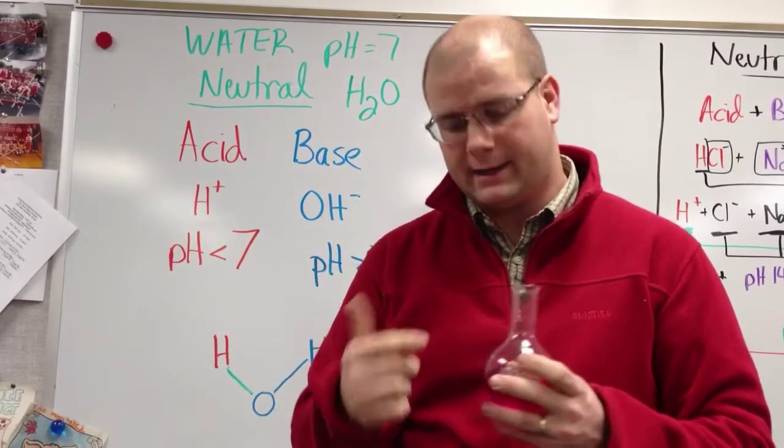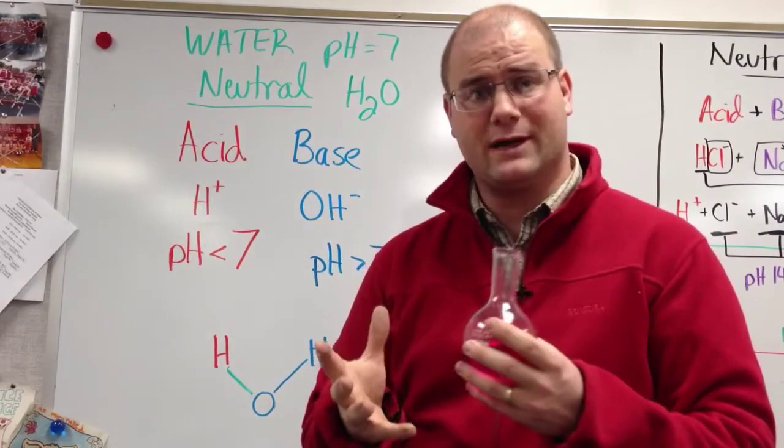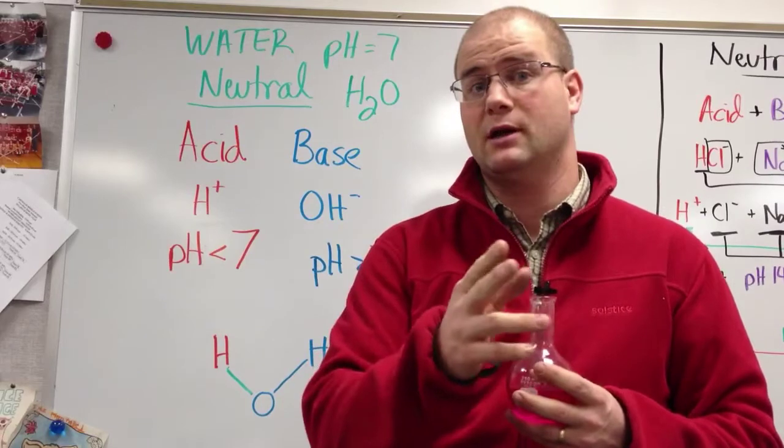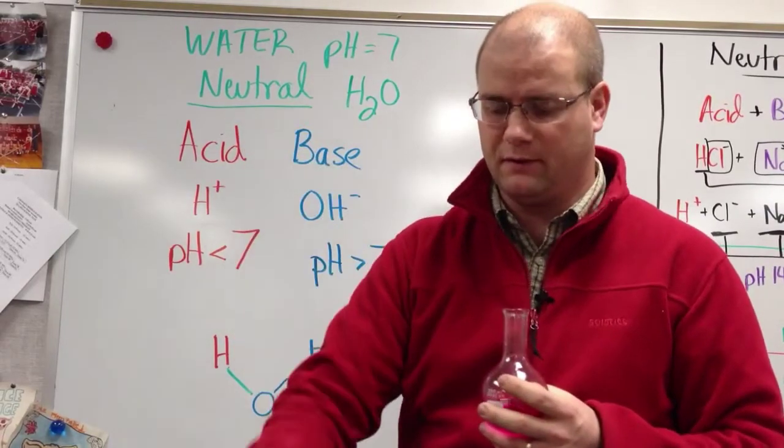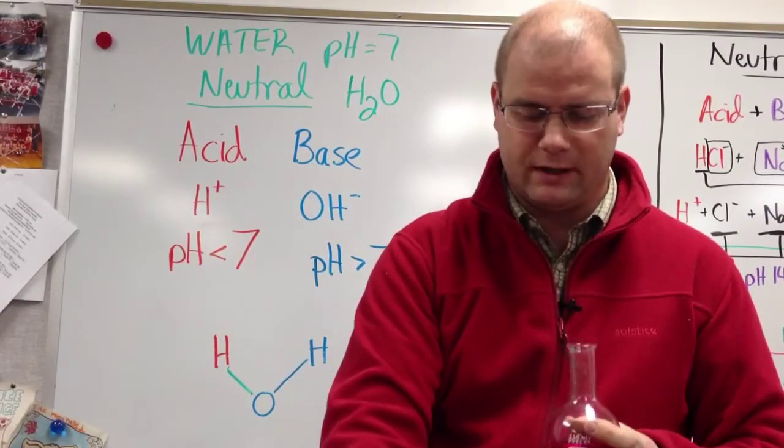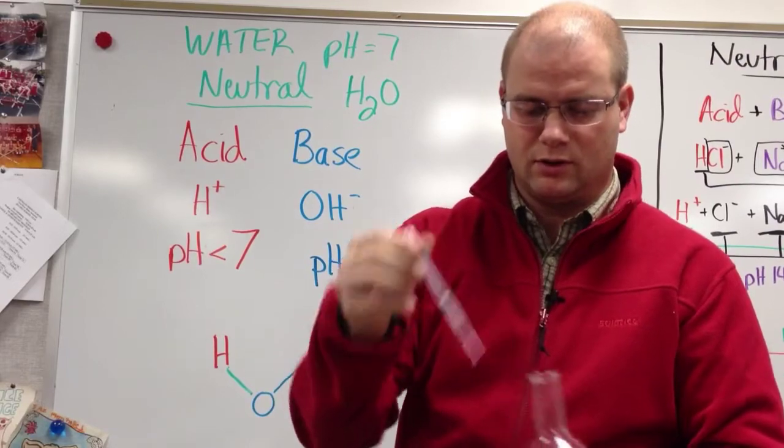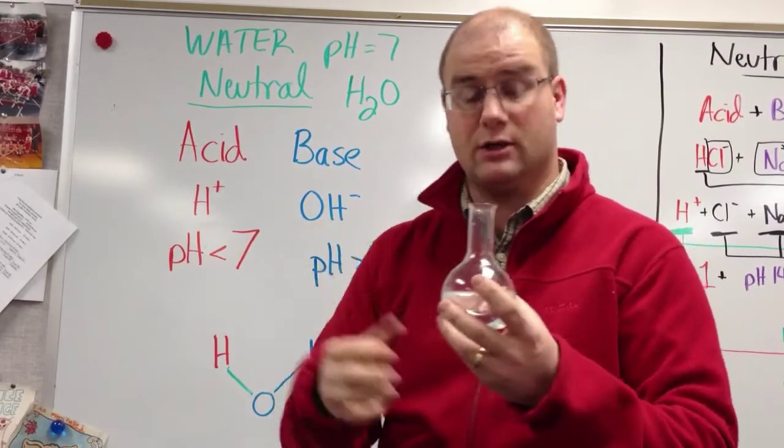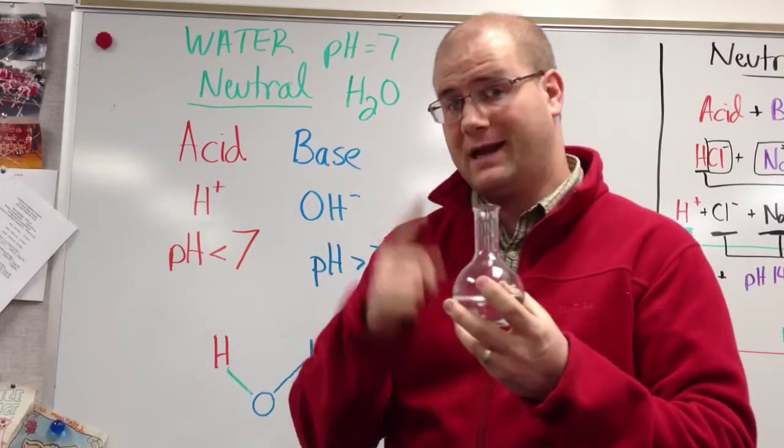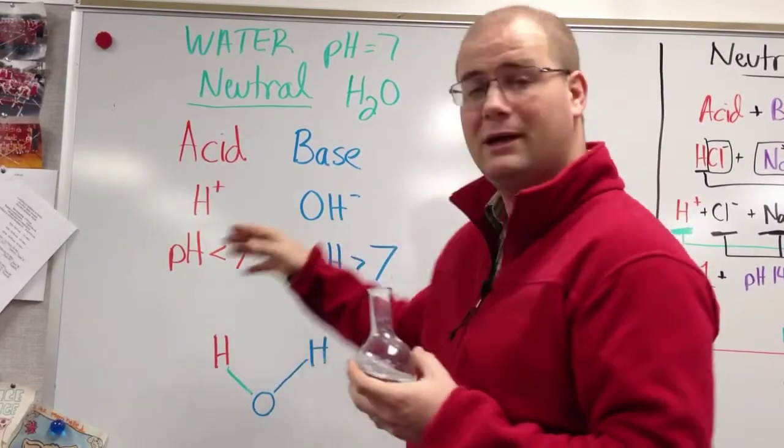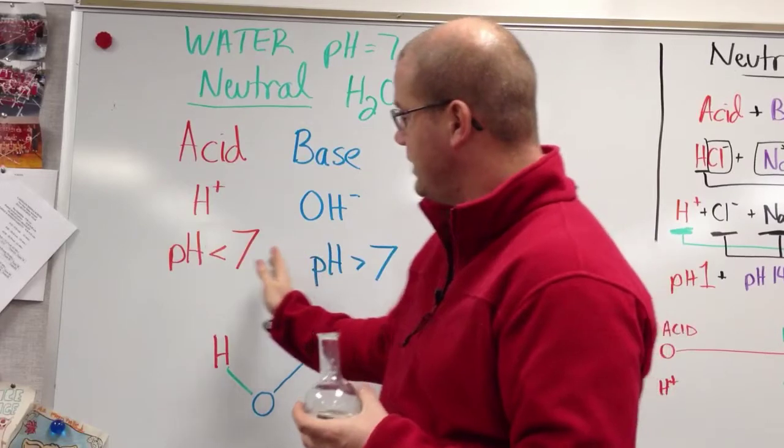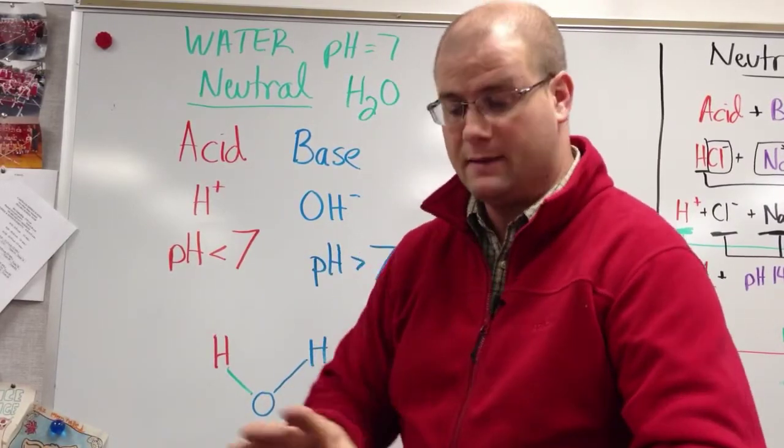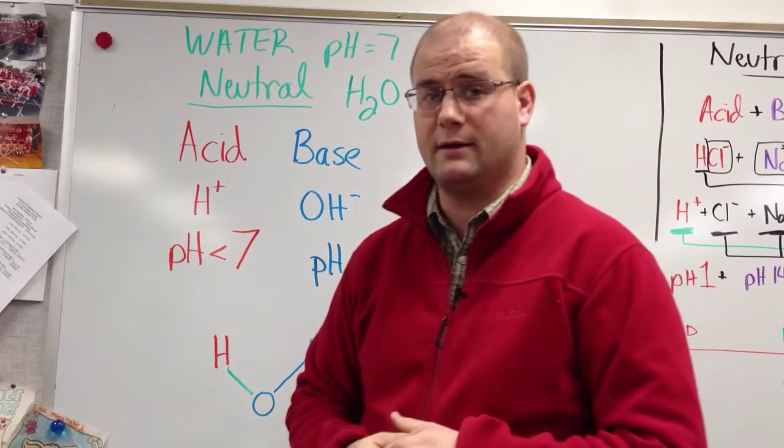So can I go back? Well, actually the reaction between the acid and the base is much stronger than the reaction between the base and my phenolphthalein. So if I grab some acid, squirt that in there, swirl it around so that the molecules get to hit each other and those ions interact. The acid now has neutralized all my left over base, brought the pH down below 7, so I have mostly acid in here now. And now the phenolphthalein doesn't indicate anything.